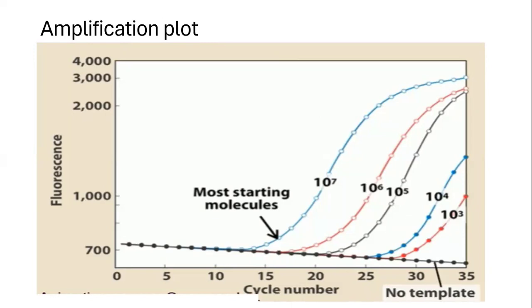The starting material can be any type of, say, infectious particles such as RNA infectious particle or DNA infectious particle. If we are using a DNA infectious particle, then we can directly quantitate it. If we are using RNA infectious particles, then we need an initial reverse transcription step to convert the RNA into DNA, and then we can perform the quantification reaction by using the real-time PCR step.